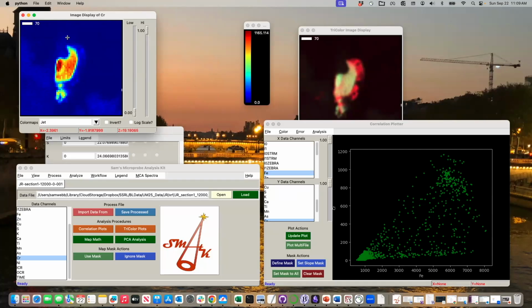So hold it down. I'm going to start here and you see I make a little white line. I'm masking out my area. I'm voraciously holding down the shift key, not letting up. And I'm going to meticulously draw a lovely line around this chromite grain here. And again, double click here and it finishes the mask and closes it.